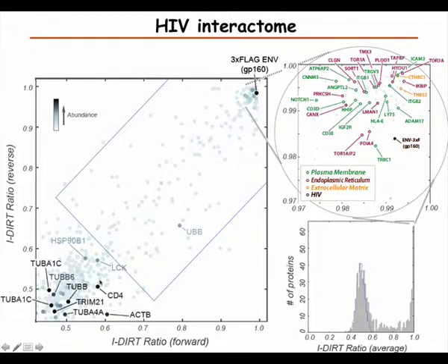And then we have a lot of proteins down here at 0.5, which are the non-specific ones. If we go along here, you can see the histogram: there's a peak at around 1, and then a peak around 0.5. Then there are a whole bunch of proteins here in the middle, and these are the ones that are fast exchangers.